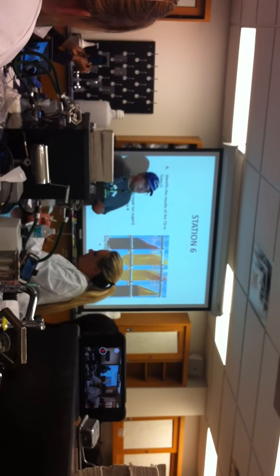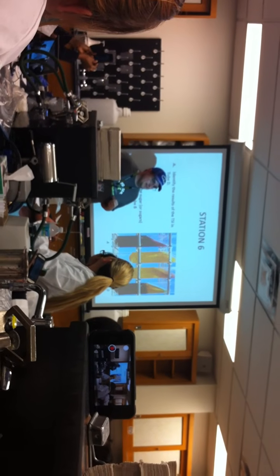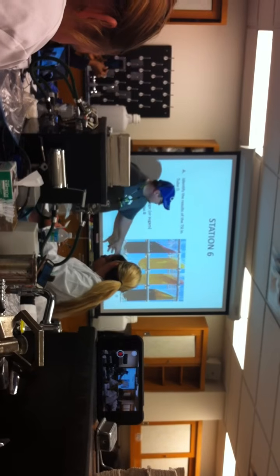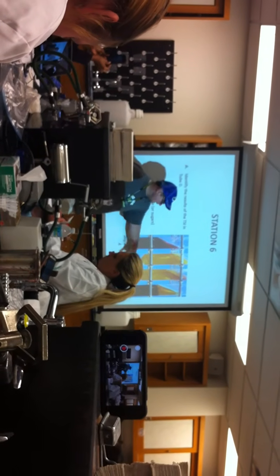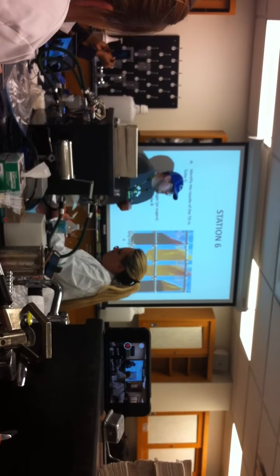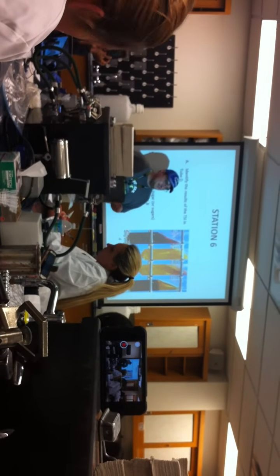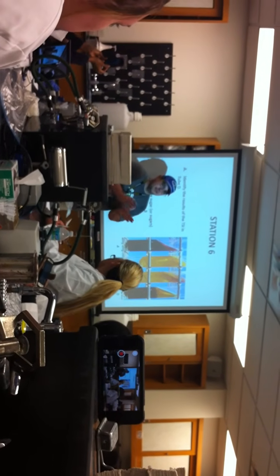Color over color. Well, it's fermentation over fermentation, right? So that would be A over A. Okay? Did we get any black precipitate? No. But did we get gas? Yes. Okay. Now, in normal circumstances, I would have you guys do the lettering scheme.